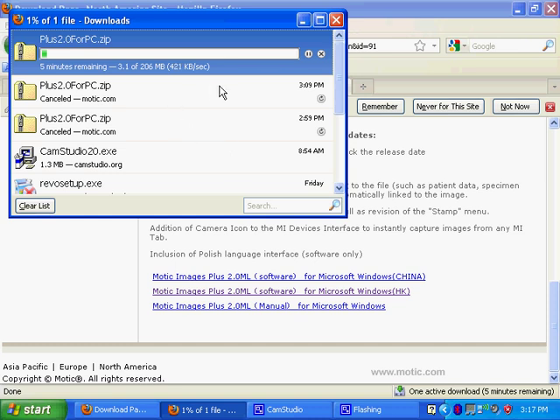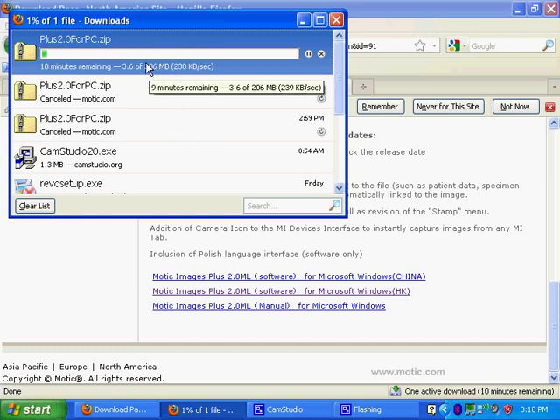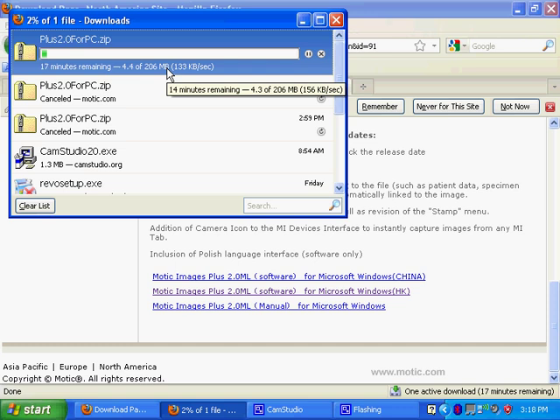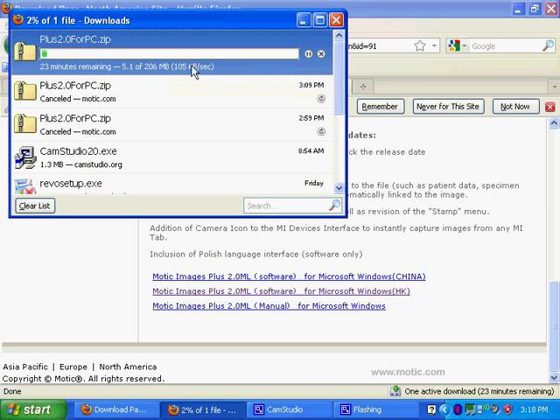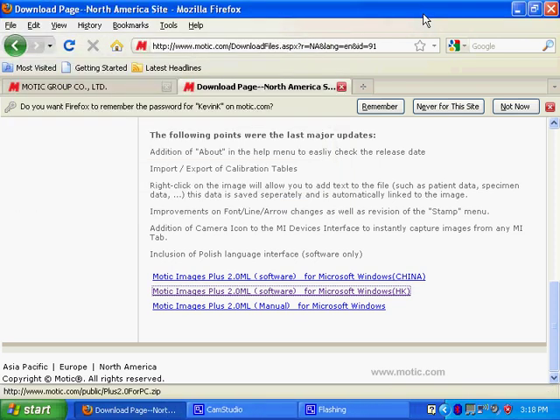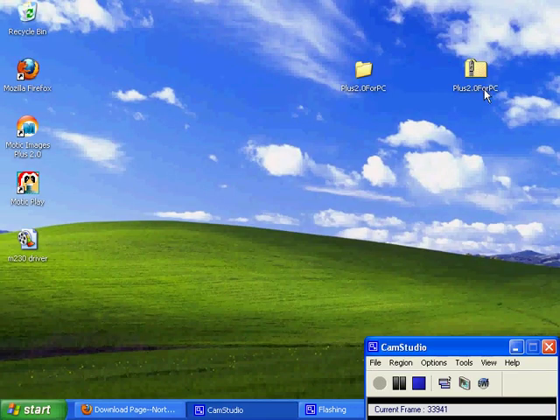As you can see it's downloading right now. My version says the total size of it is 206 megabytes, yours may be different, as long as the size matches up. If you have the file that you downloaded, the zip file, then you're probably fine. I'll cancel it here because I already have it on my desktop.